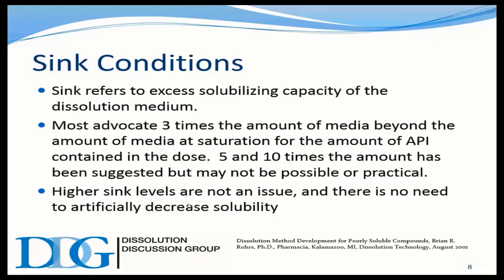So getting back to getting started on this topic, just a discussion on sink conditions. This really refers to how soluble or solubilizing the dissolution media is. We're somewhat limited by the traditional dissolution test. With a 1-liter vessel, we typically run about 900 milliliters in it for various reasons. That's just become the standard volume. I know a lot of the old BP references, British Pharmacopoeia, had 1,000 mL volume capacity in many exercises. But for most, a 900 mL volume is about the maximum people prefer to use.